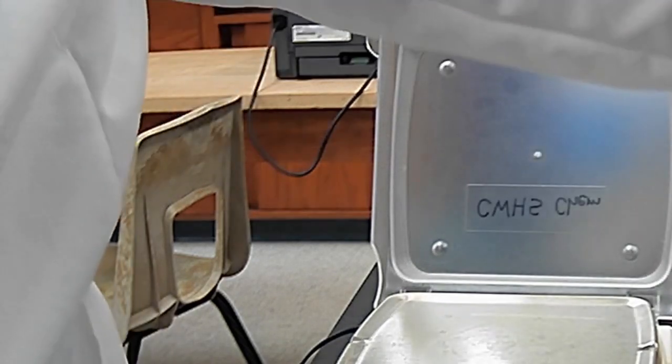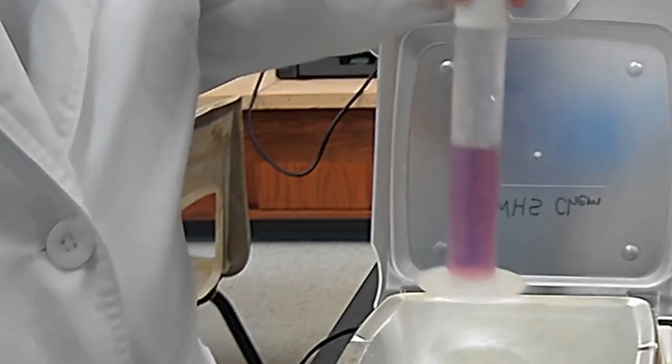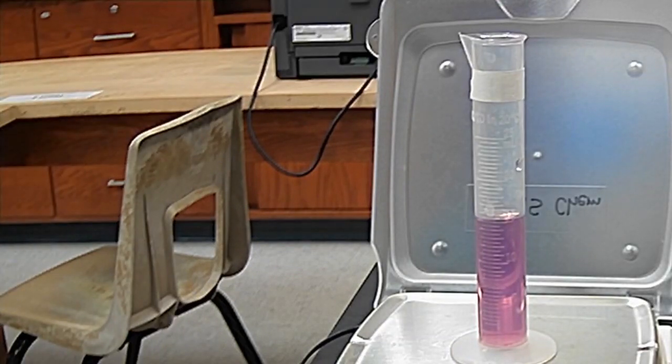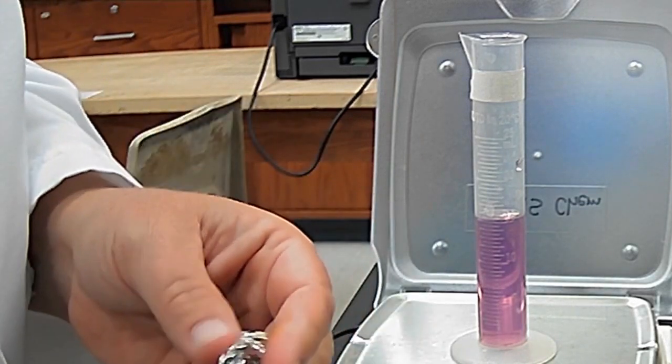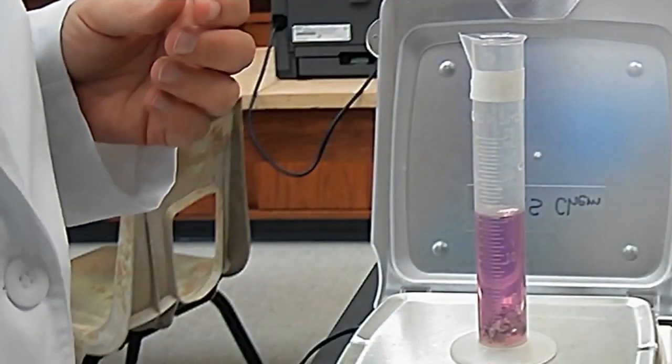Now we're going to go and we're going to work on metal B. Okay, so here's our first one for metal B. This is going to be trial 1. And the beginning with the water and the cylinder is going to start out at 25.9 grams. Now I'm going to take our metal. I'm going to get a pretty good sample in here. Okay. We're going to put that in there.